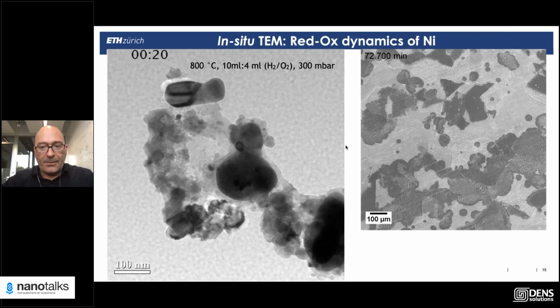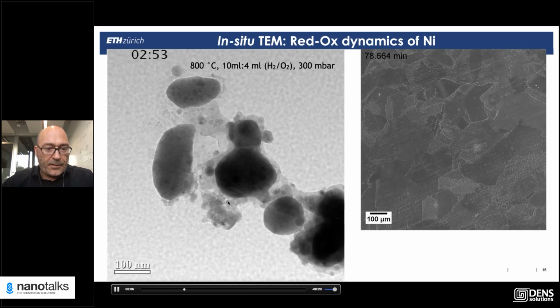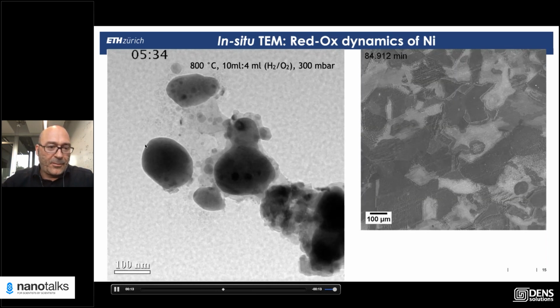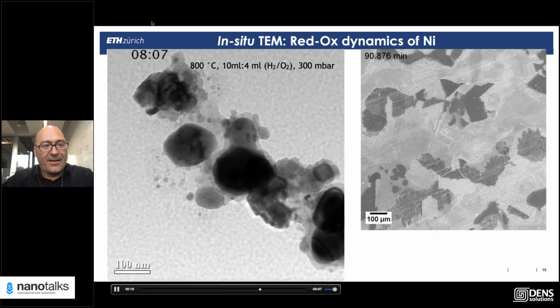And then we looked at the coupling. On the left side, you see a number of particles. Now this is metallic. This is now oxidic down here. You see they're flickering, but they're not synchronized. Yeah? This is, let's say, now metallic. Now it's oxidic. But when they touch each other, it's like infecting, like a disease or something.